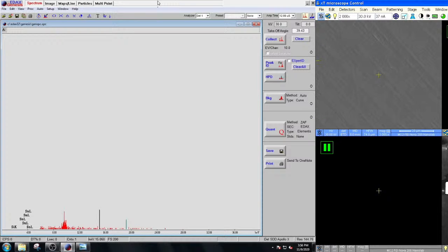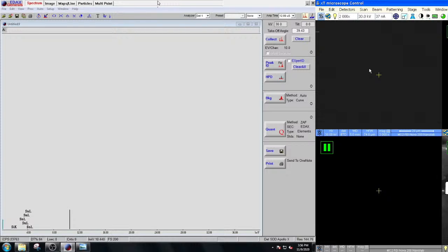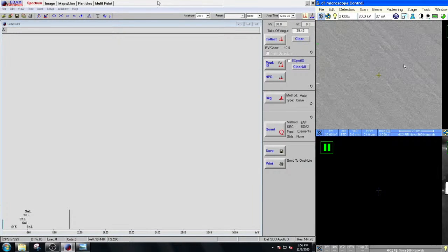All right, so we focus on it, we get in focus, let's add our position, and we'll come back over here, and let's just say, what? All right, so what's going on here? I switched it back to mode 1. All right, we've got to go back to mode 3. All right, here we go.